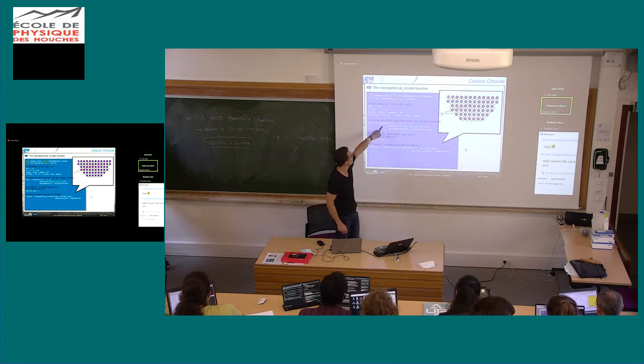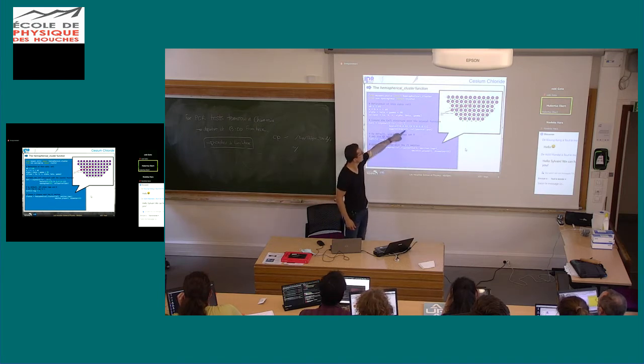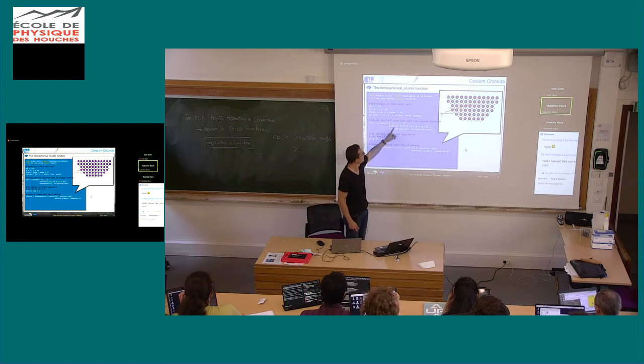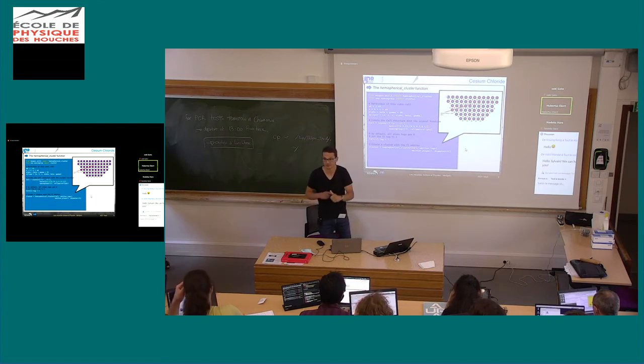So you can use the crystal function in the space group module, for example. It is a more general function to create things. You specify the space group, the cell parameters that are just a list of a, b, c, alpha, beta, gamma angles. And the basis is where your cesium is located at the origin and your chloride atom. And here, the hemispherical function I used is somewhat different. First, as you have 2 different atoms, cesium and chloride, you have to differentiate them to tell which one is the emitter.